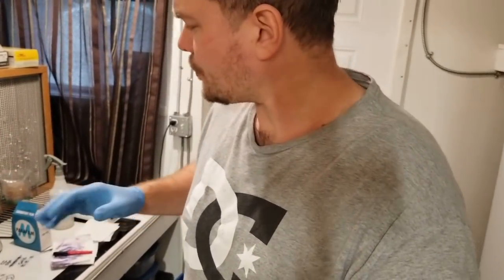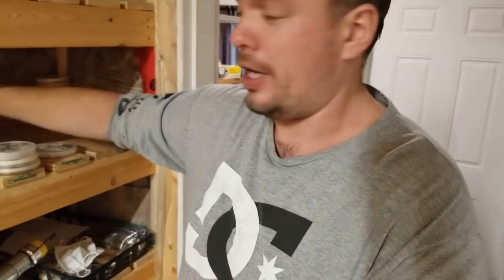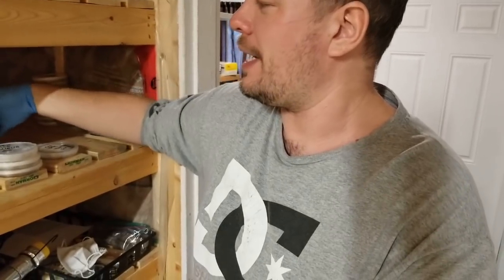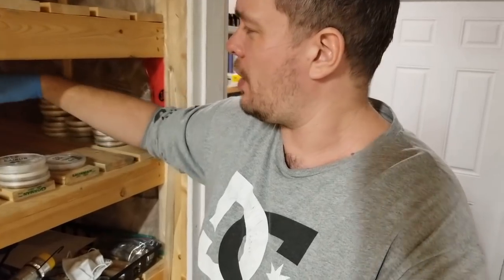I'm always growing different stuff all the time. So for our schedule, I'm in here every week making plates. I'm always expanding test tubes to plates to get those started, and then those plates I'm getting expanded into production plates. We'll expand a plate between maybe 7 to 15 plates depending on the species. Because we grow seasonal, we have to keep production of warm weather and cold weather so that I can make adjustments based on how the season is developing.